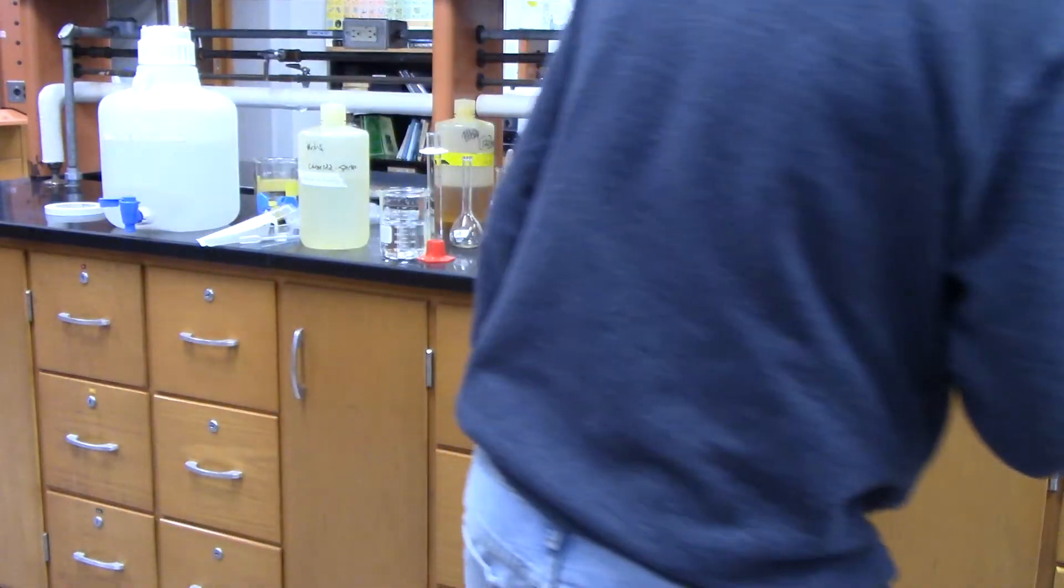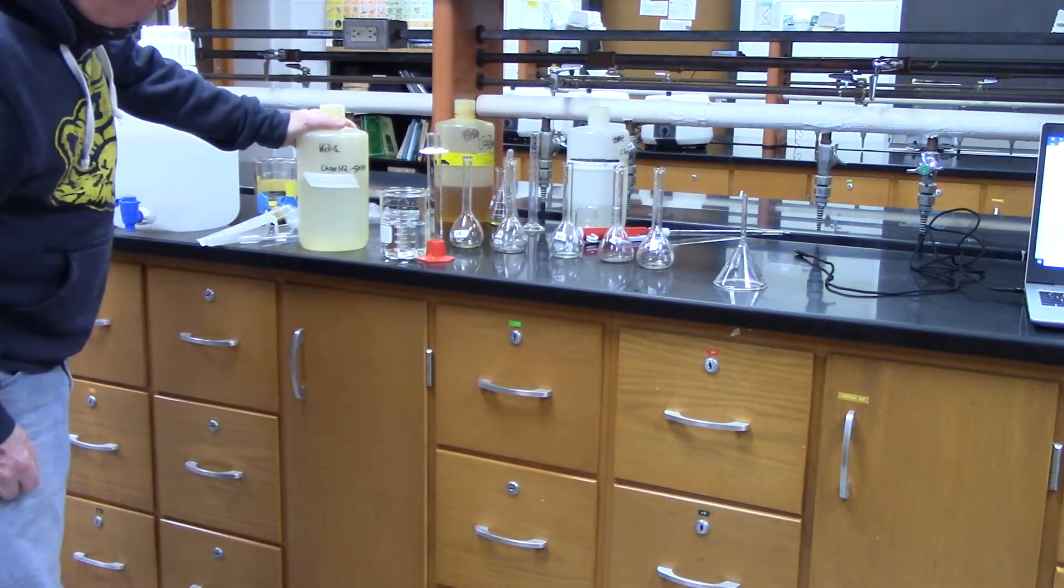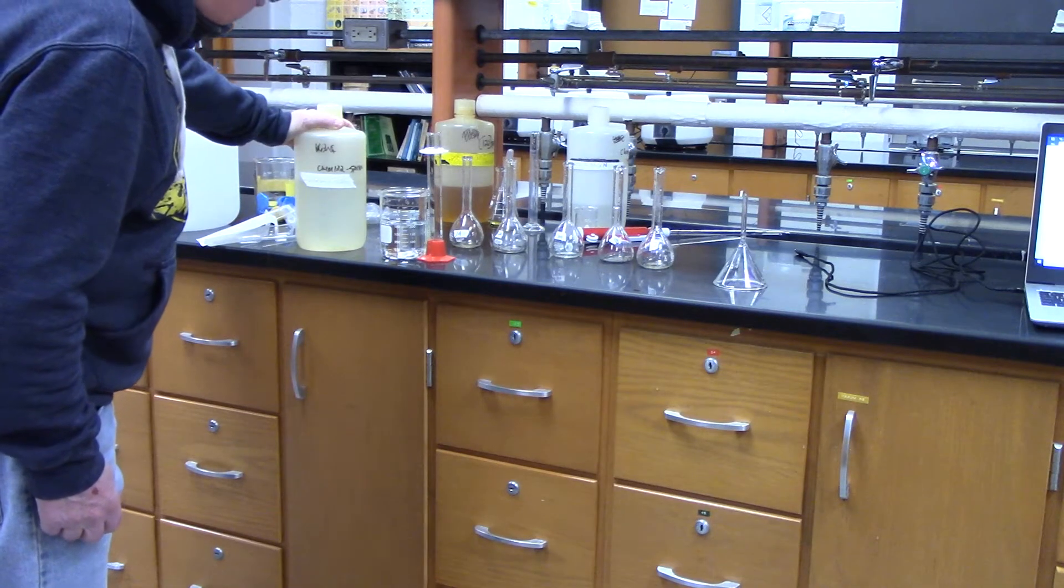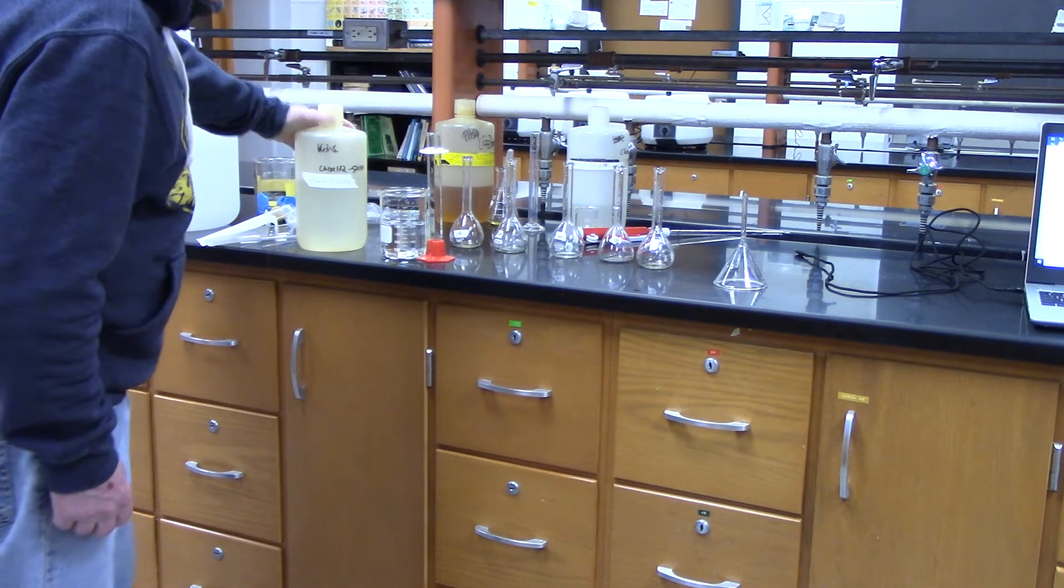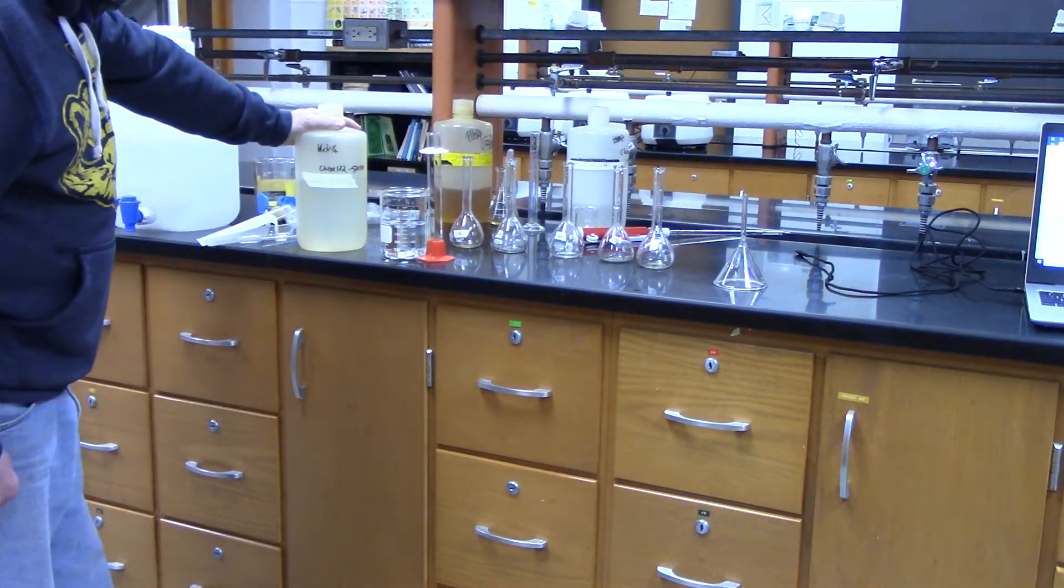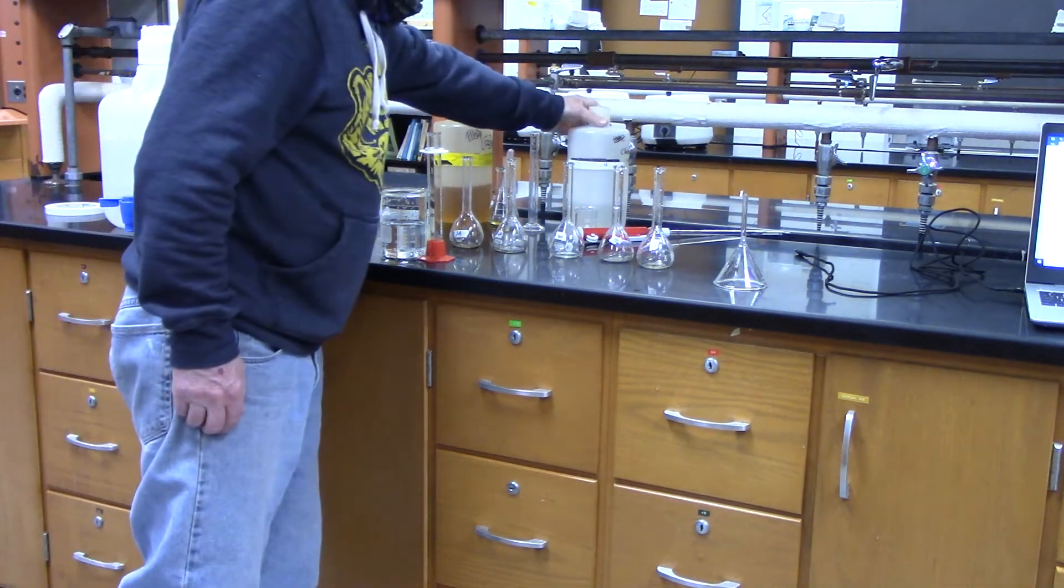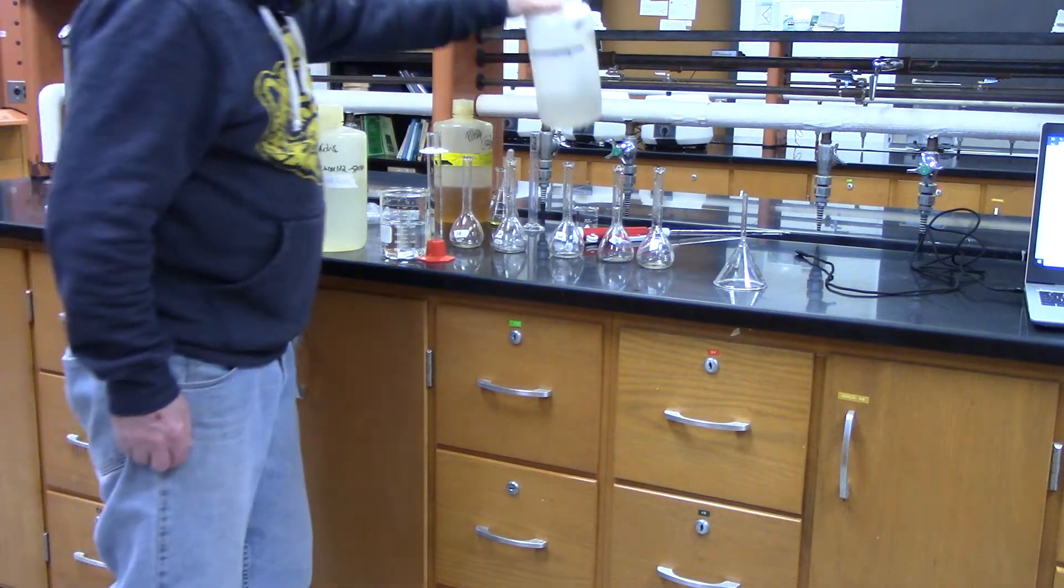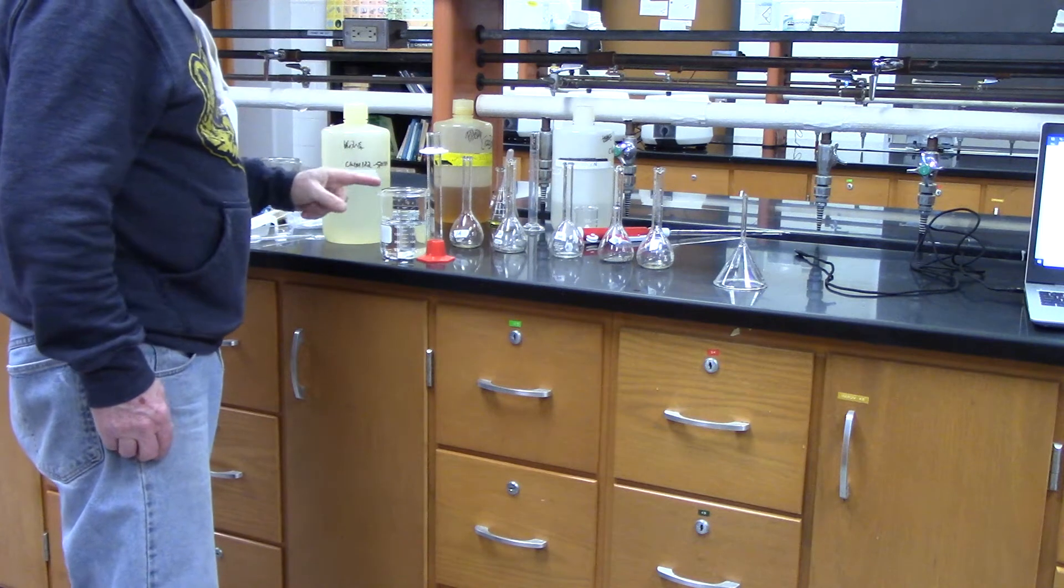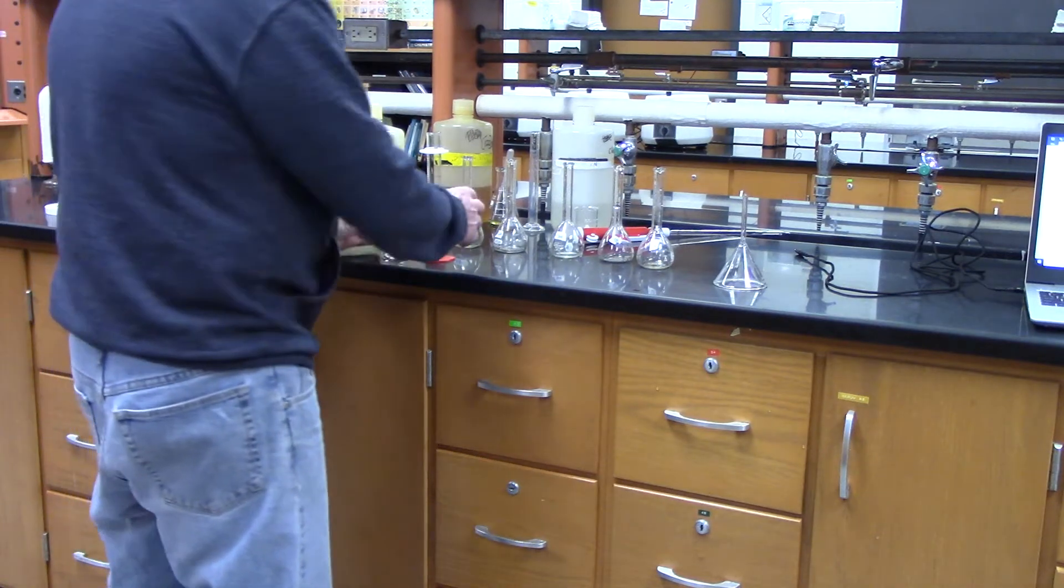Each one of these will have 50 mL of 0.002 molar iron nitrate. That's the same as this, but diluted by almost 100 times. And then what we're going to do is add varying amounts of the thiocyanate to each one and then bring them all up to 100. So I'm going to put 50 mL of the 0.002 molar iron nitrate into each one.